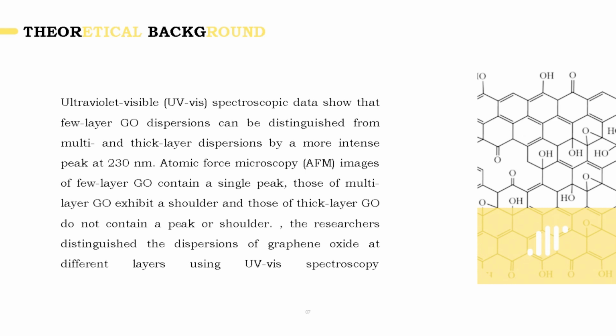However, these are not widely used methods because of their expense. According to Wu et al., the differences of the spectra of the graphene oxide samples can be identified using AFM observations, where it determines the number of layers each sample had. These observations allow the layer number distribution of GO to be calculated easily.